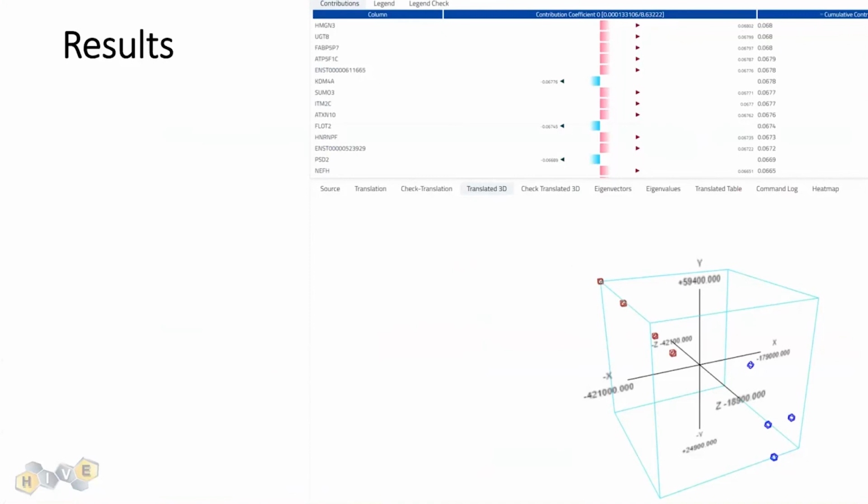And then so on. And so this will find anything that a prepackaged tool like DE-Seq will find, but then it may also find more on top of that. And that's because these other tools will find things that are orthogonal to each other, or very close to it, meaning independent, basically. So if you move in one dimension, you're not really affecting the other dimension very much. So that would be if they're 90 degrees to each other. And so they're effectively independent.